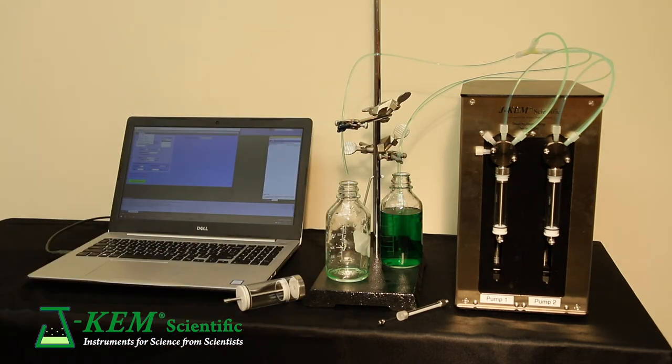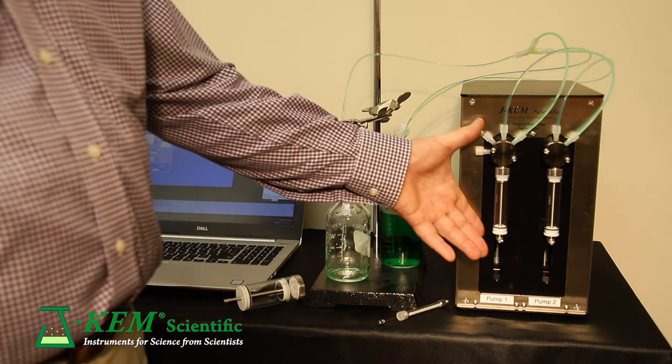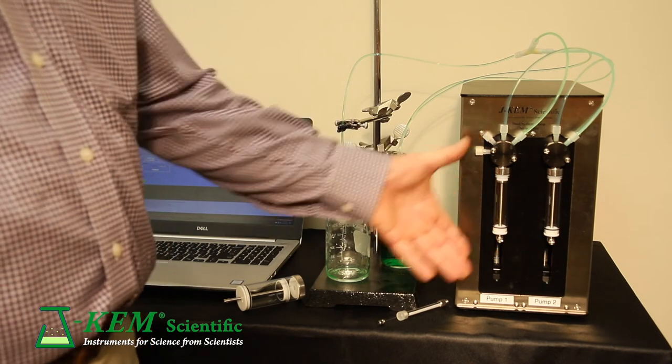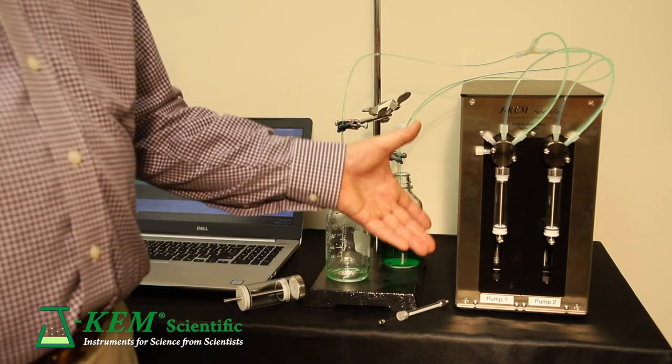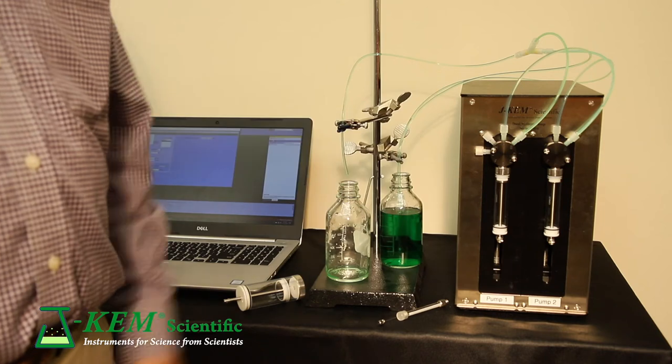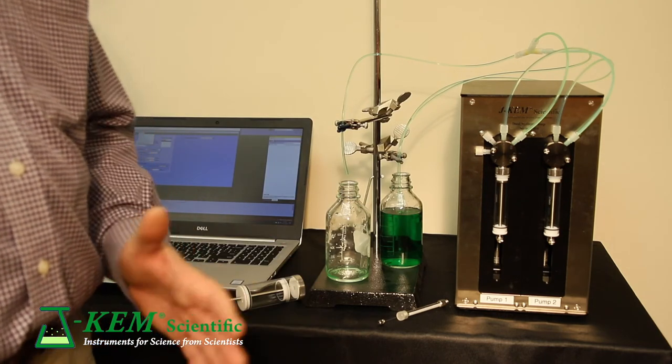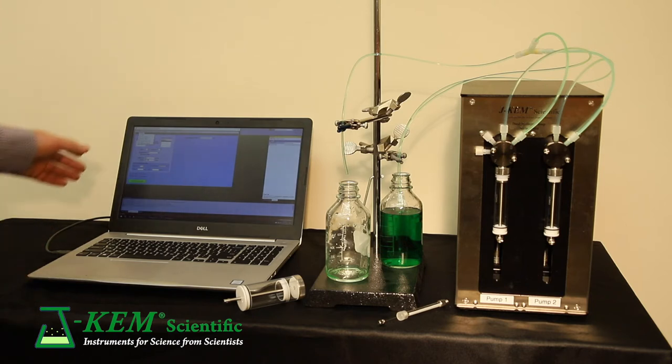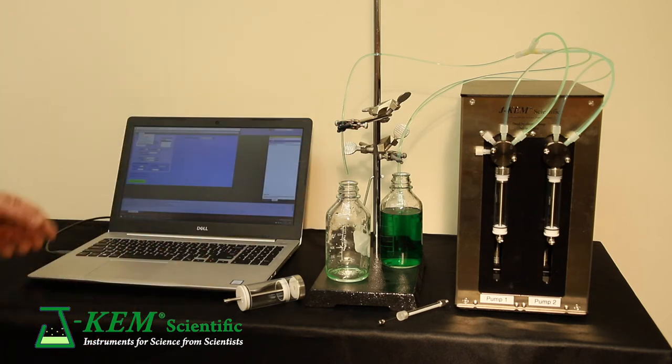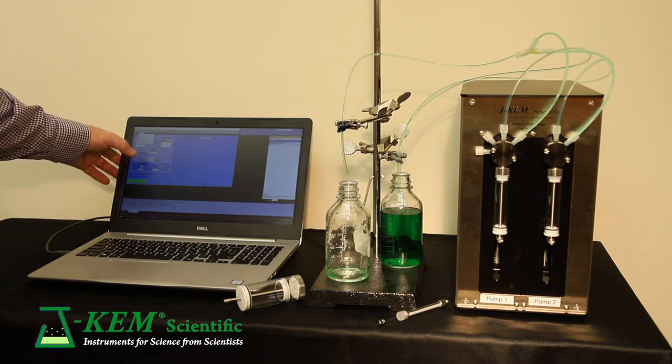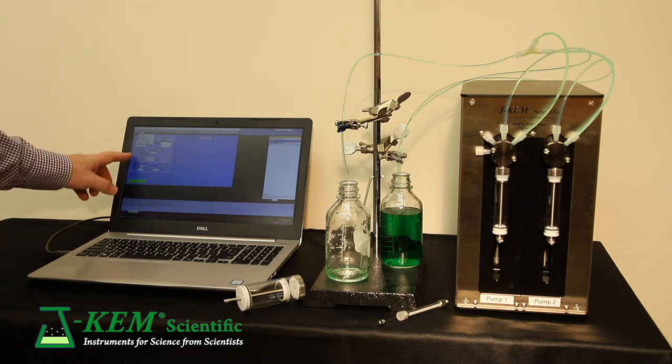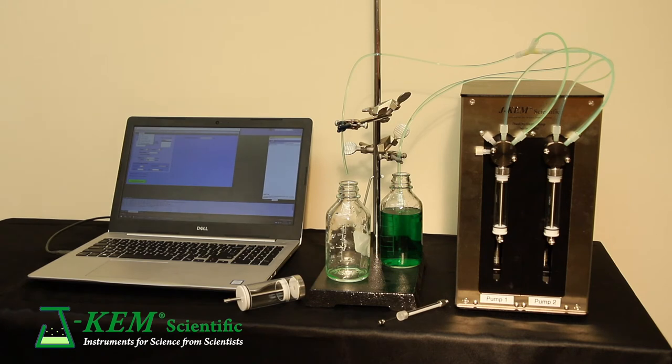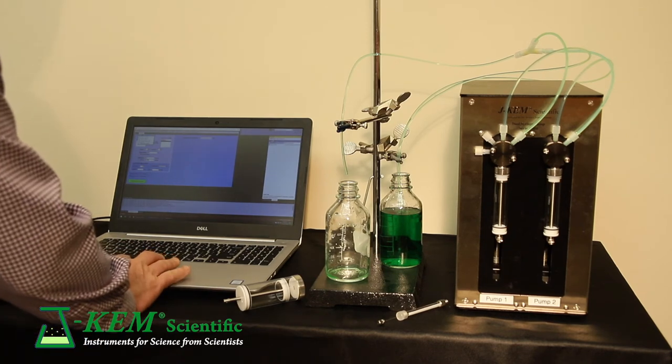I'm going to first run a demo using just a single pump so you can see how they add. And once you see how the single pumps add, then you can watch and see the difference between a single pump and a dual pump addition. So for this experiment, I'm going to run it fairly quick. I'm going to ask the 10 milliliter syringe to deliver a total of 25 milliliters at a rate of 25 milliliters a minute.